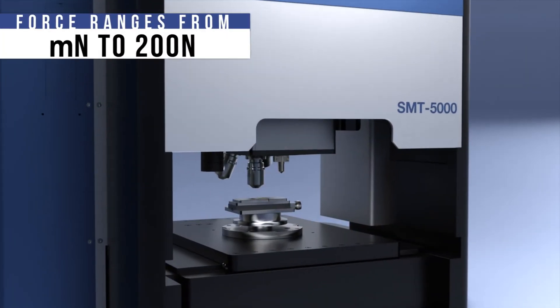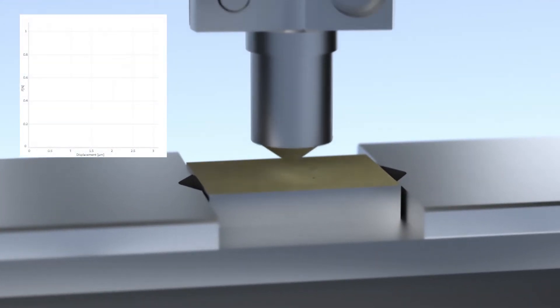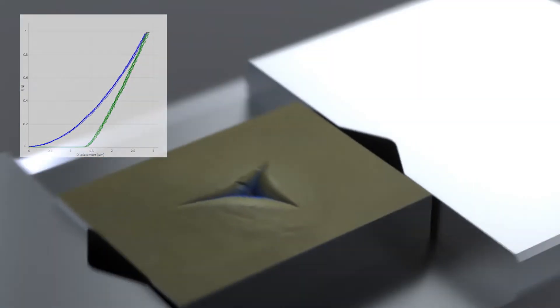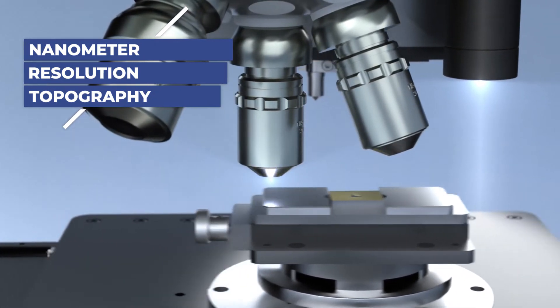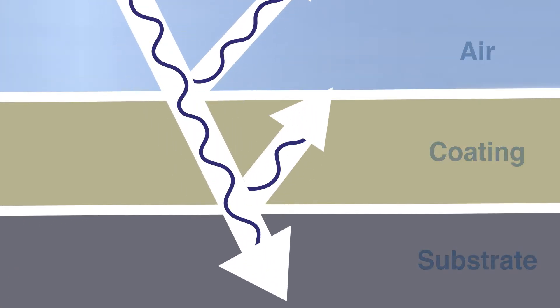With force ranges from millinewton to 200 newton, the indentation scratch tester measures normal and tangential forces along with vertical displacement, all while providing nanometer resolution topography using optical profilometry and nanometer precision non-contact film thickness using the spectral film reflectance probe.